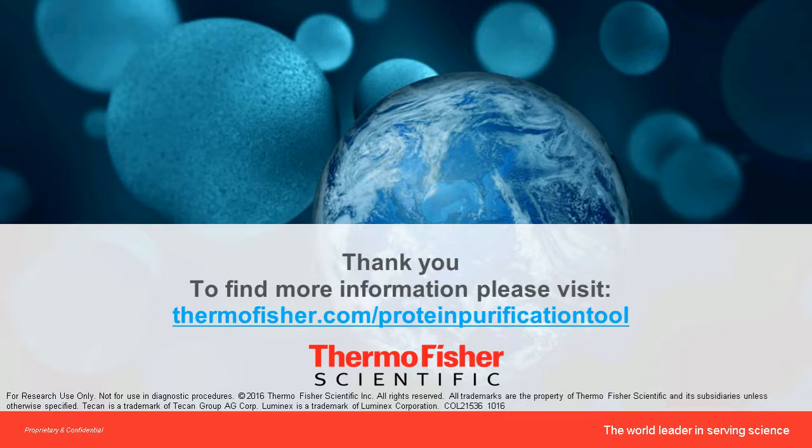Excellent. Thanks, Bhavin. And our next question asks, which method is more sensitive, ELISA or IP-MS? I can answer this question. So what we found with the targets that we had for AKT-mTOR pathway, ELISA depends on what kit you use.